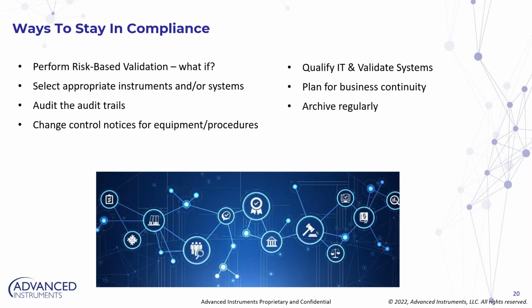But the reality is that also, although the device is providing you with all of this, there's a lot that still needs to be done from a compliance perspective. You as an organization, all of your team members, you probably perform a risk-based validation. What if something happens? Do we have that covered? Selecting the appropriate instrument, equipment to fit into that will obviously make your risk-based validation easier.